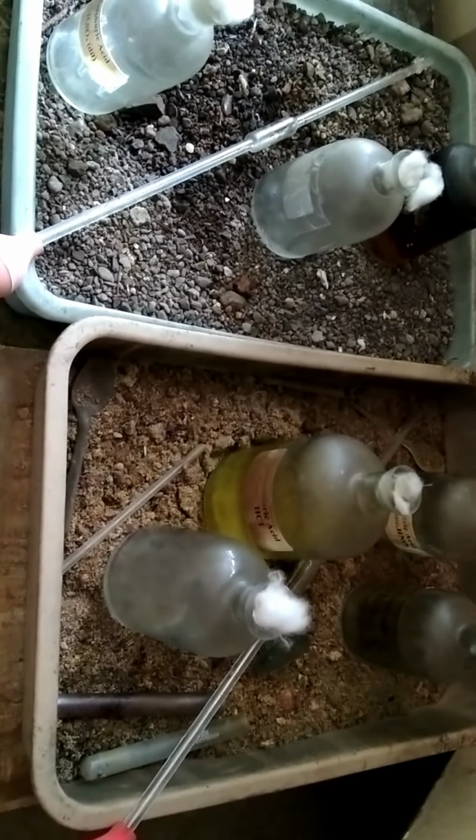And stock solutions are kept apart in the laboratories for the analysis, which are used in physical, organic and inorganic sciences in the practicals. Generally dilute acids are very important. Dilute acids and dilute bases are used in the analysis in the organic as well as inorganic experiments.